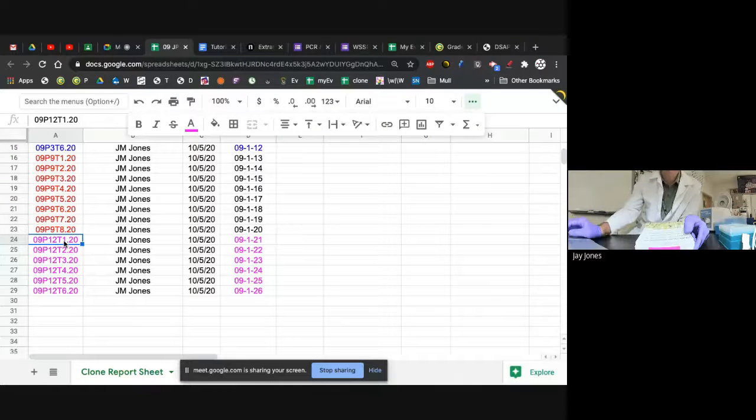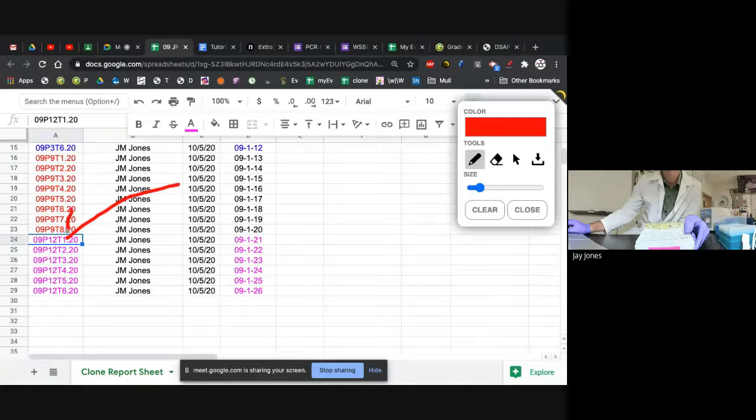So this is the clone name. Right here's the clone name. This is the spot in the box. This is the date we started the overnight, and this is the person who prepared it. That is me. All right, but these will be your clones. You guys will analyze these.